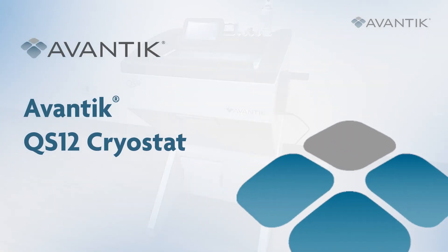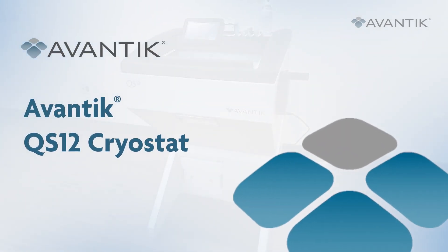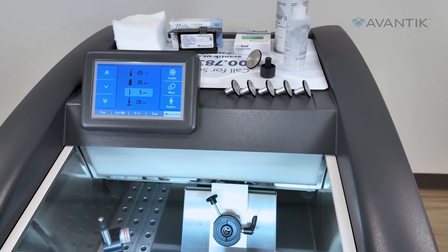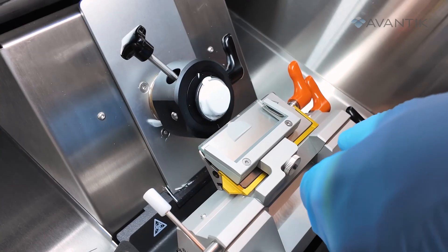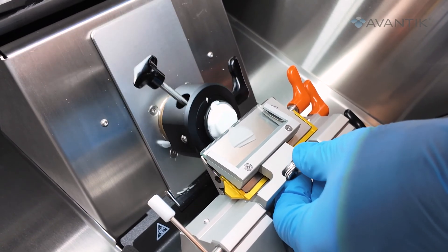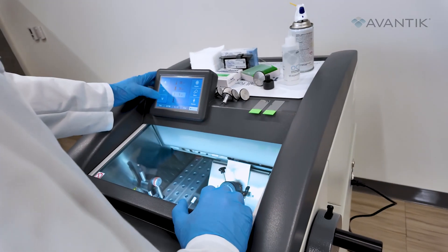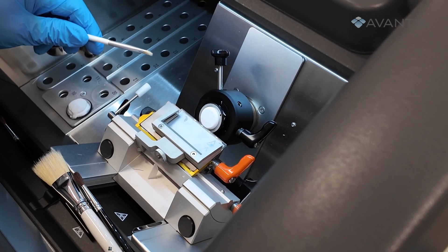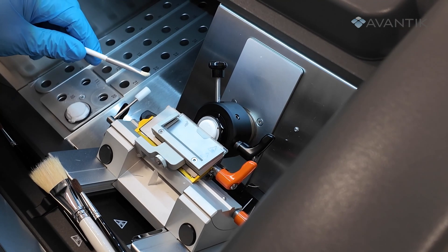Introducing the Avantik QS12 Cryostat — a higher standard of frozen sectioning for your laboratory. These user benefits make the Avantik QS12 the most advanced, accurate, and intuitive cryostat available.